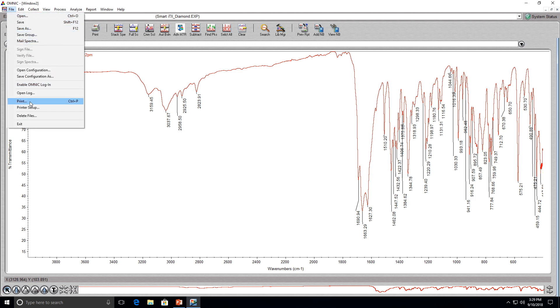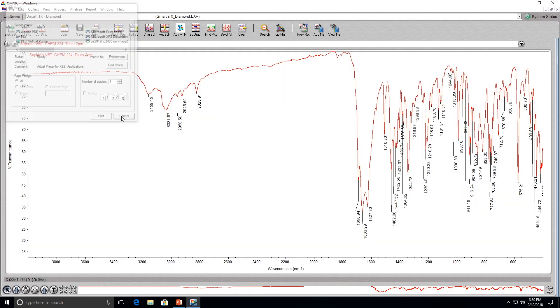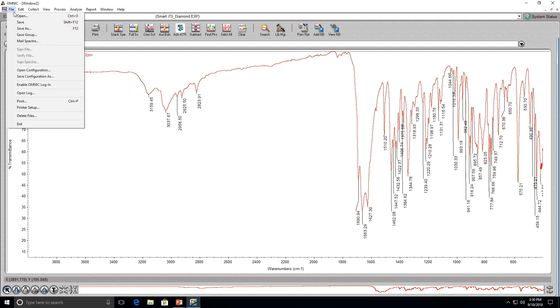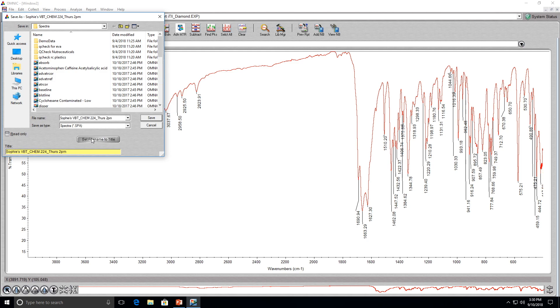Now that you're finished analyzing the spectrum, you can print it out to the desired printer by using the file drop-down menu and clicking on print. Before you exit the software, make sure to save your project to the computer. It should be saved as a .spa file. You can click on the set file name to title button if you want the file name to be the same as the spectrum title.